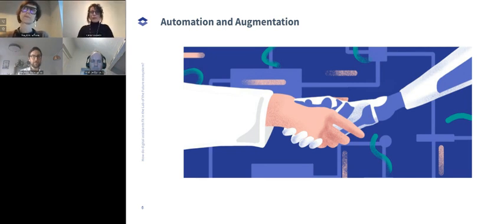Yeah, you could think of it like this: if you have super manual tasks, automation won't help you there. You might be at the fume hood, at the bench doing something, but there's still a need for digital documentation, where a lab assistant can help you. Or things that Sidar mentioned, like, hey, warning, humidity is high, or hey, warning, your stock is out of control. In a fully automated system, that probably does not matter anymore because you have automatic processes to handle your stock management somehow. That's fine. Still, an assistant might be necessary to keep all that in place and in control, to power the automation.